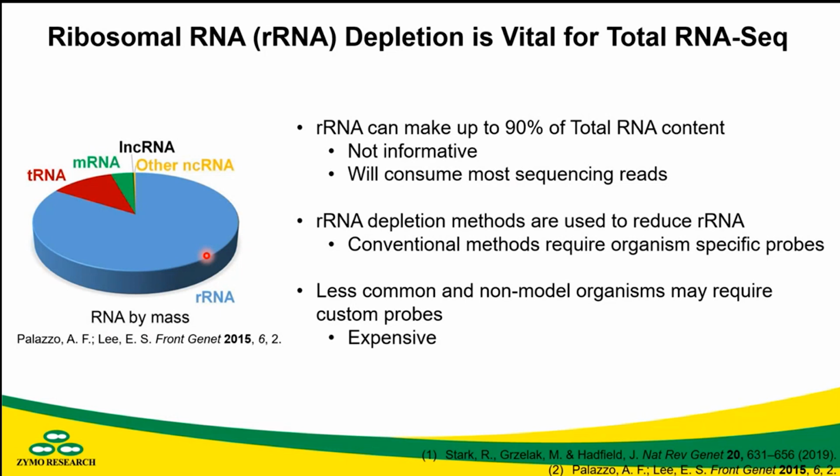What this means is that this procedure is quite expensive, because not only do you need to design, test, and modify, but it may also not work. And even if, luckily, it eventually works, the whole process is very time-consuming, because you also have a lot of bench work that is very labor-intensive before you have a tool to utilize and answer the biological questions that you are originally interested in.